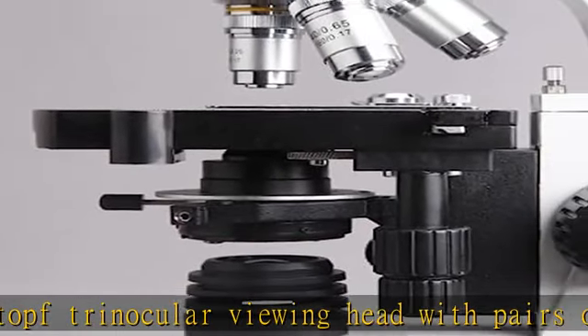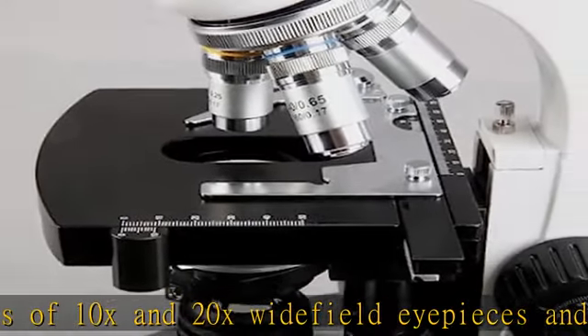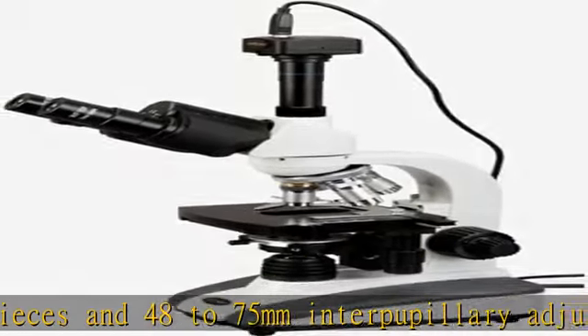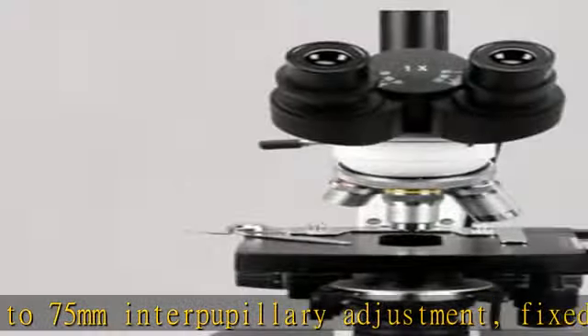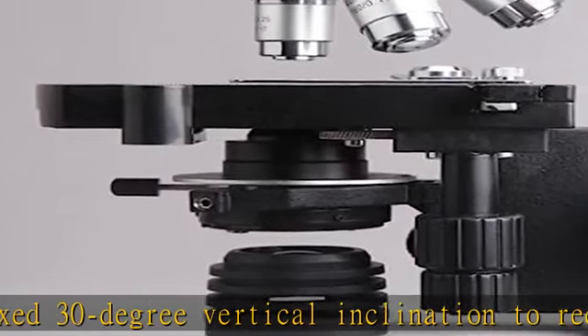Nose piece objectives: 4x, 10x, 40x spring, and 100x spring oil. DIN Achromatic objectives that provide color correction of magnified images. Brightfield LED illumination and 1.25NA Abbe condenser with iris diaphragm for clear examination and light control.